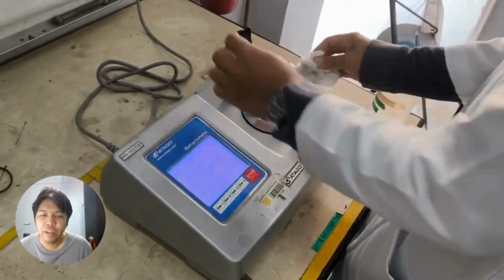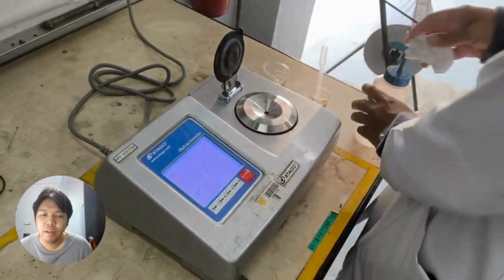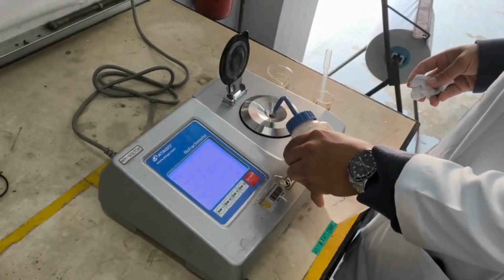After finishing the reading, the plate was cleaned again using deionized water.